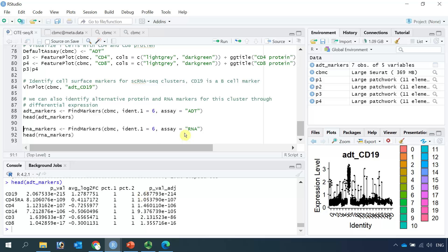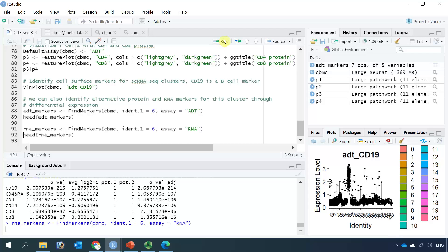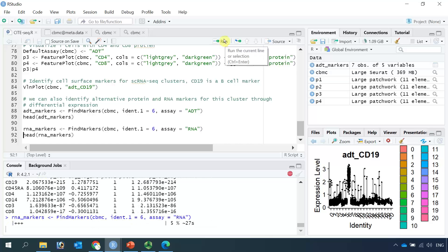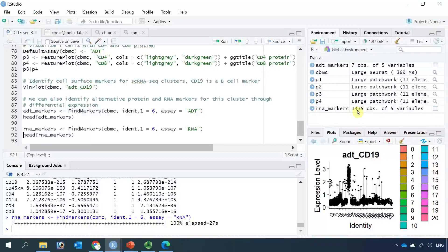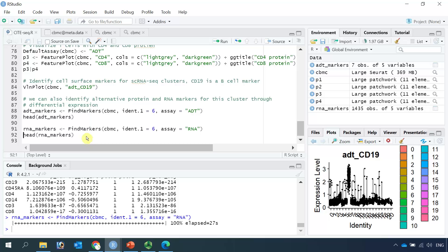Then we can use the FindMarkers function to identify protein markers for B cells, setting identity one as 6. If we run it, we find 7 markers for B cells. You can see CD19 is the number one protein marker to label B cells. Next, we can identify RNA markers for B cells — once again, we set identity one as 6 and run it. You can see we identified 1,435 RNA markers for B cells. We can have a look at the top RNA markers.